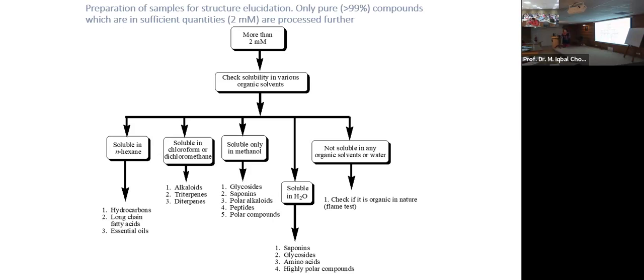That has a huge amount, so definitely it will be recorded first as a proton. Your sample, which is 1, 2, 3 or 5 milligrams, has no comparison with the solvent. Your solvent is much more than your sample.